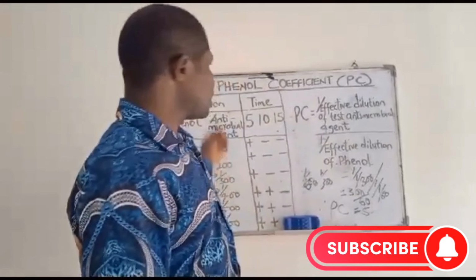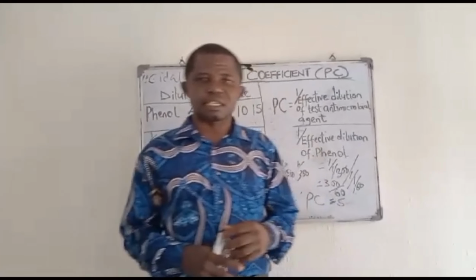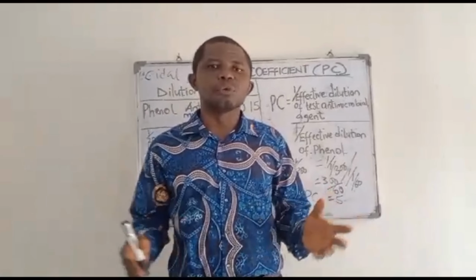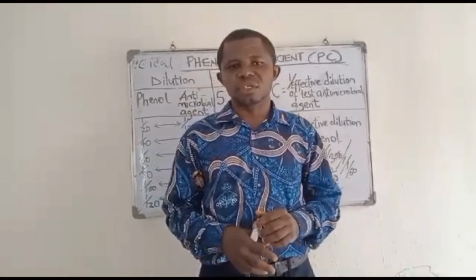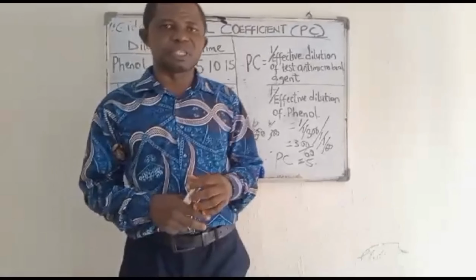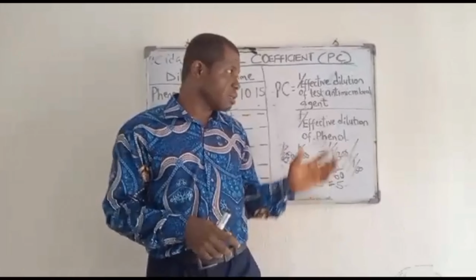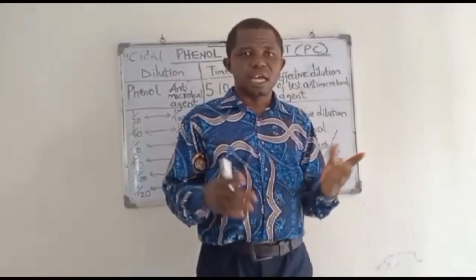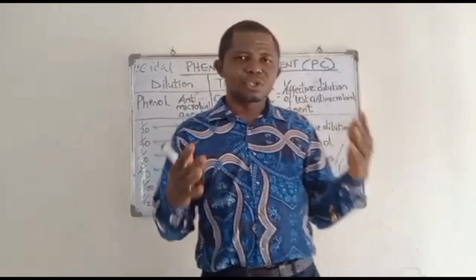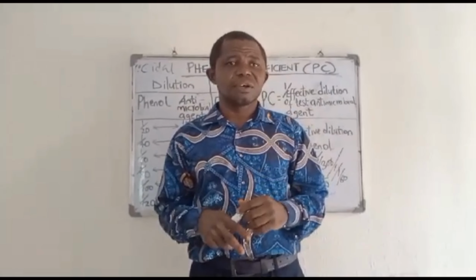So that is one. Then two, the phenol coefficient is important and used in several countries, in Europe, in America, and in Asian countries. Most antimicrobial agents, disinfectants or chemotherapeutic agent solutions or solids are usually tested. My dear students and viewers, I know several of you are very resourceful, skillful and enterprising.